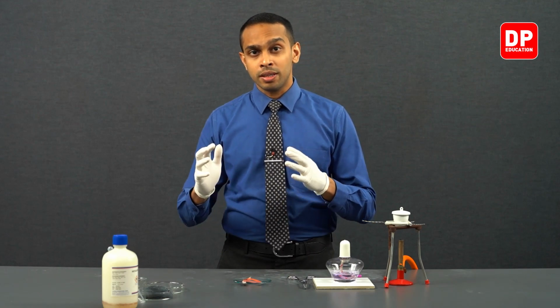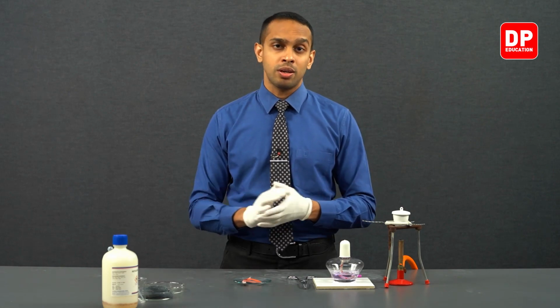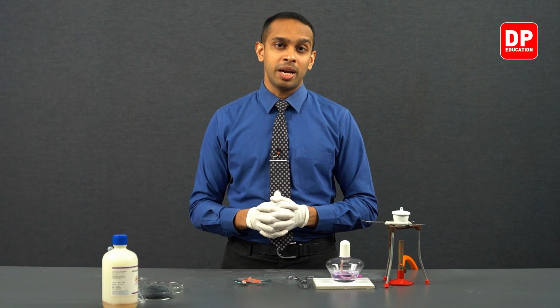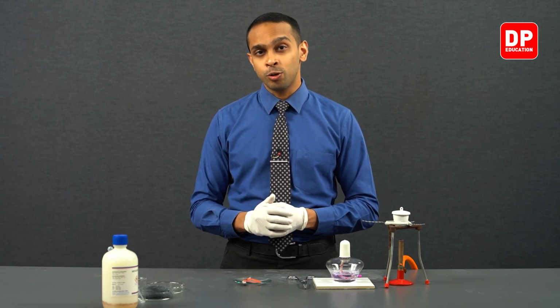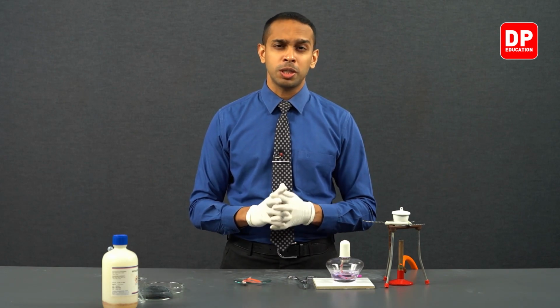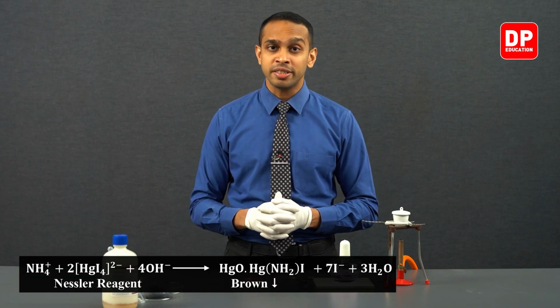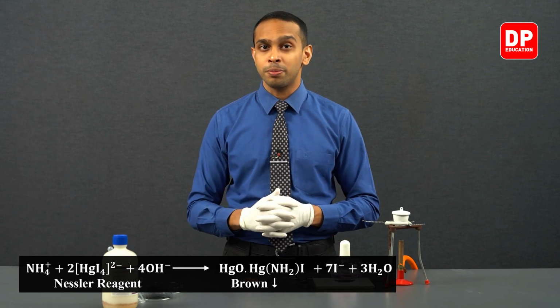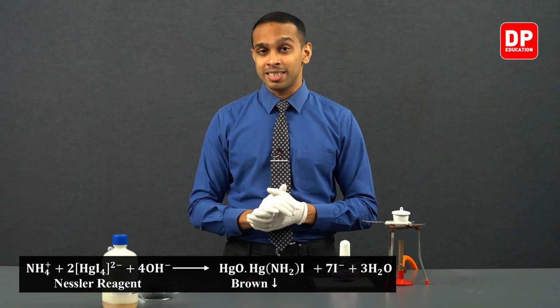However, the magnesium nitride will react with the water to produce ammonia, which can be identified by the use of Nessler reagent. As you know, if you add Nessler reagent to a solution containing ammonia, it will turn a brown color. It will form a brown colored precipitate in the presence of ammonia or ammonium ions.